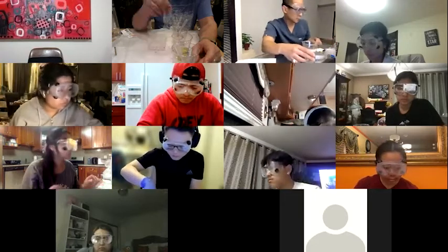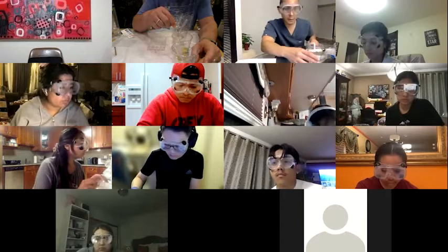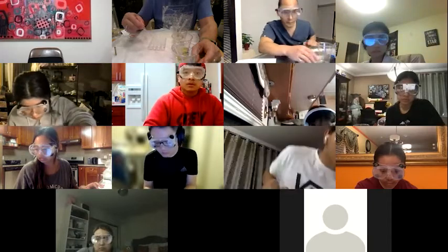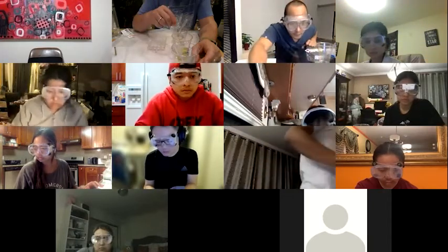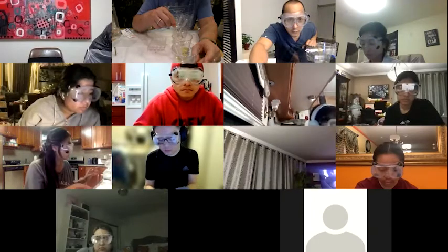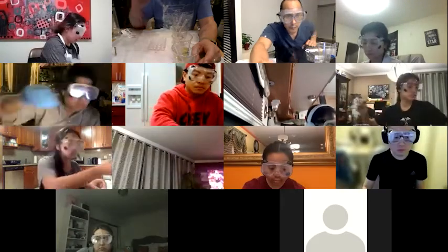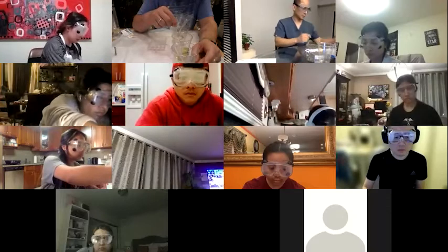Gotta say, I'm impressed with how pretty these colors are. I didn't think it would be this obvious what the differences in pH are. And we can add another drop or two to the wells just in case the color doesn't really come through.